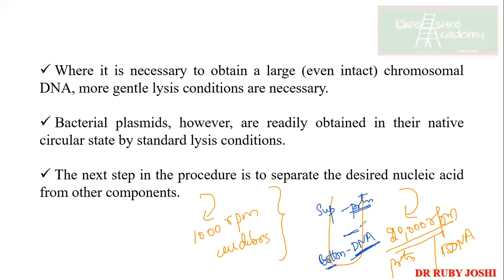In between, you can have mitochondria and chloroplasts present over here. But if the question is about the DNA and protein, then it is the DNA which is present at the bottom, and in the supernatant, it is the protein. So you have such a huge DNA onto which your proteins work, right? So which is going to be more dense?